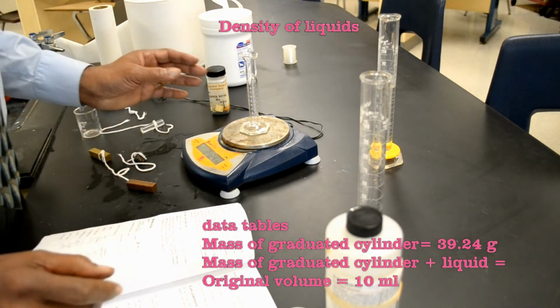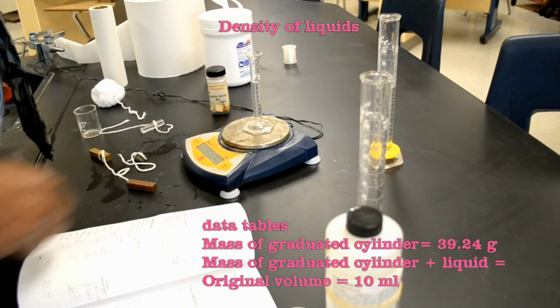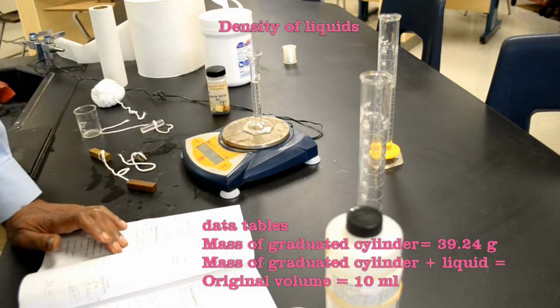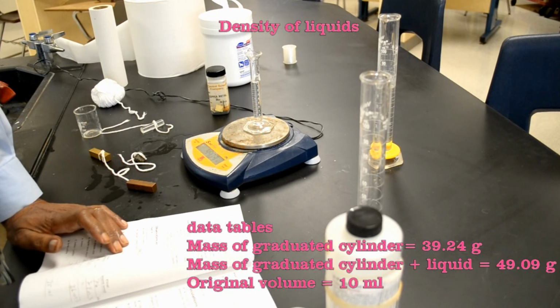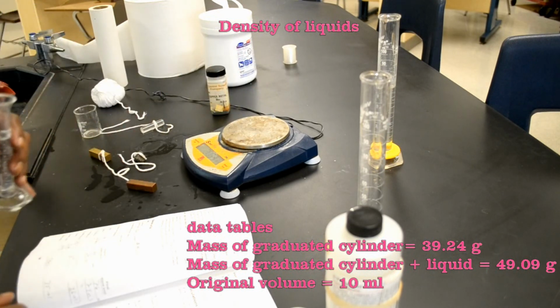Now I'm going to add about 10 mLs of water and mass it again. The mass comes out to 49.09.